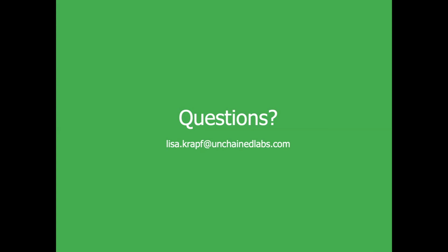Okay, great. Lisa, you talked about the sample preparation, and I have a question here for you about that. How do we ensure that other foreign particles or other things don't get into our samples when preparing and running samples using the Hound?